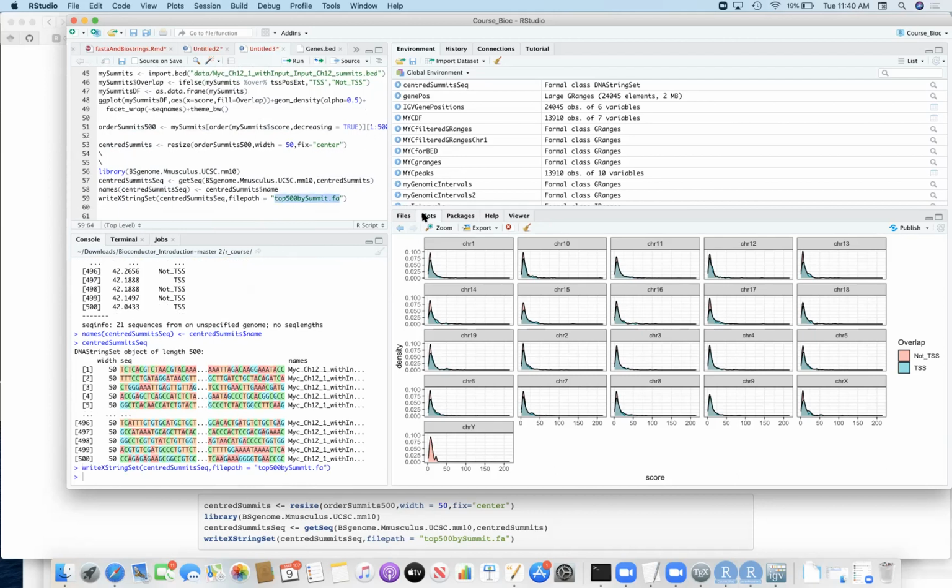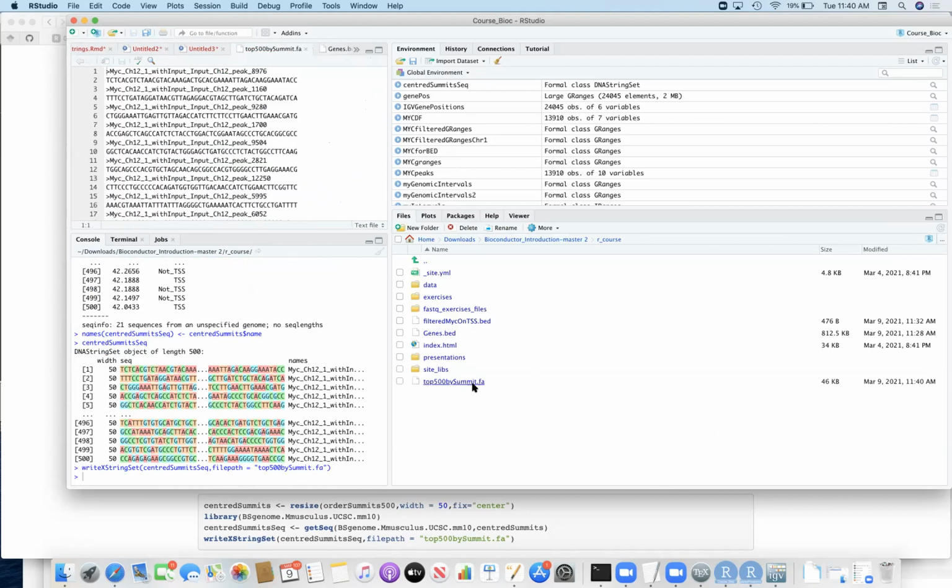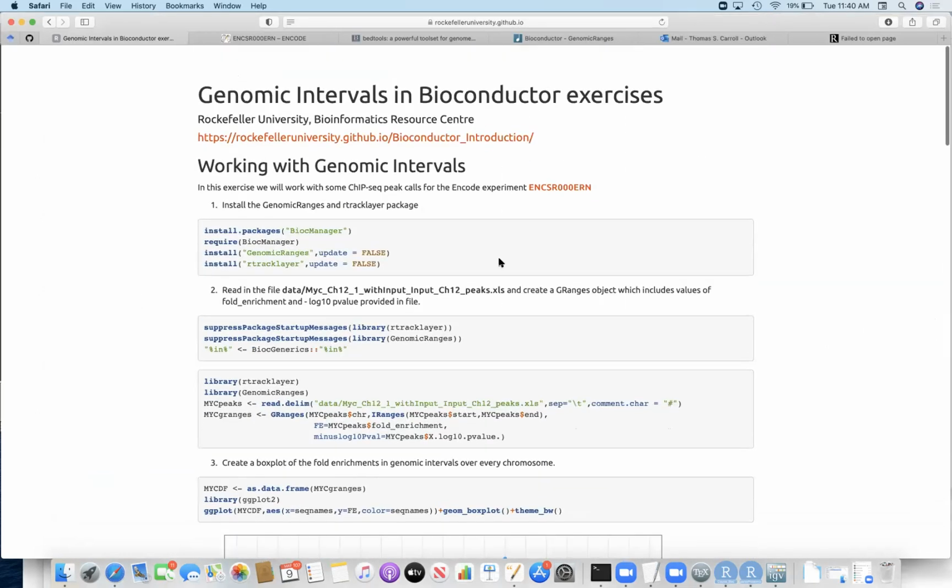And here I'm going to write it to a FASTA file. It should appear in my local directory. And we have a little bit of sequence associated to every peak, right? So we've gone in, extracted the sequence, and now we have our valid FASTA with the name ID there, and then the sequence underneath, our next name, the next info line, the sequence associated. Okay, so I think we're done there.